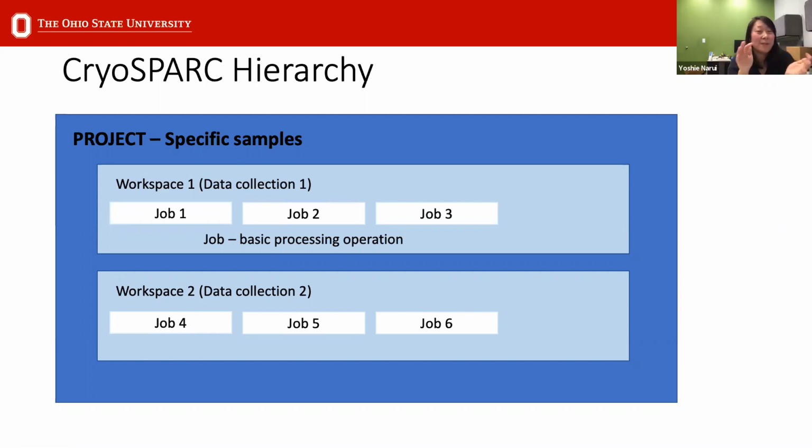So we have built our own system. It's a Linux-based system that runs CryoSPARC and Relion and has a lot of storage space and 8 GPUs, right? These types of systems, I think most PIs in Cryo-EM have in their own labs, because you need it to process the data.